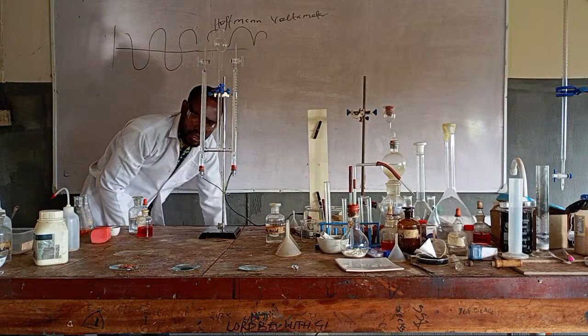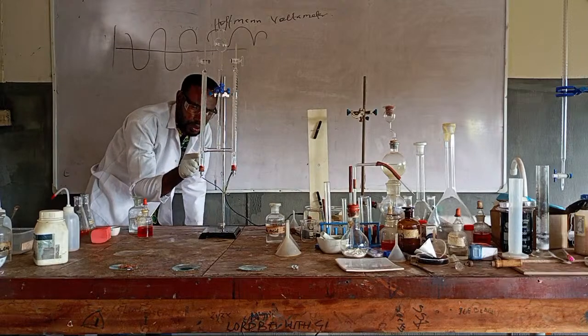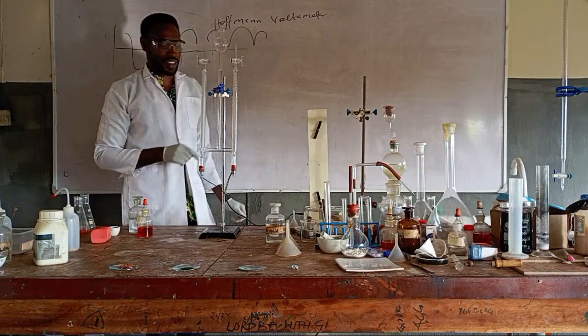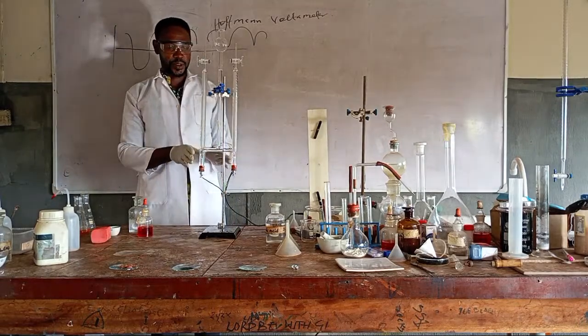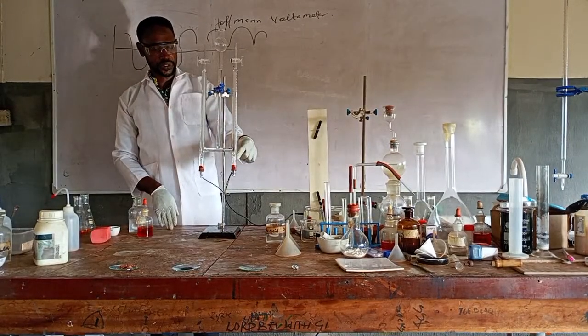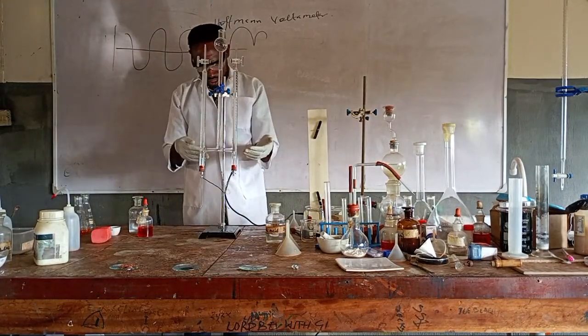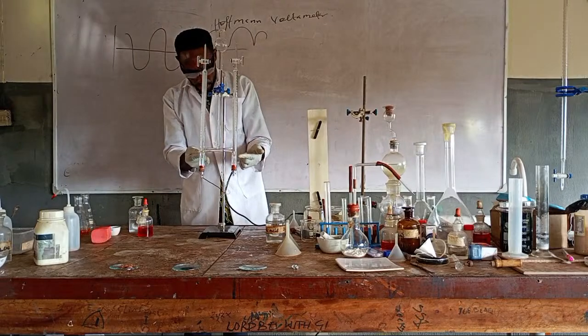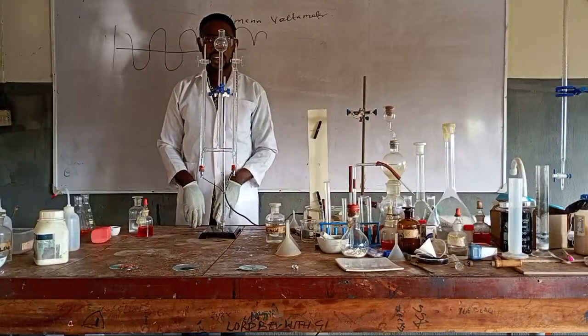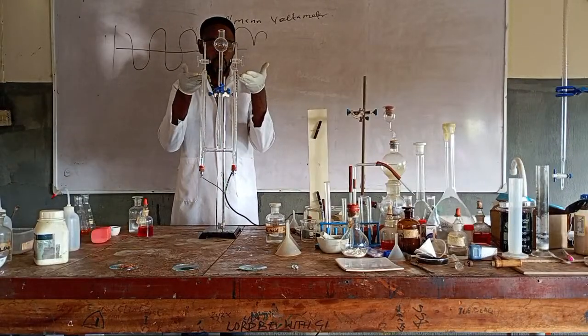If you watch closely, you can see bubbles. Are you seeing something? Okay, don't worry. But just know that the electrolysis is in progress already. For some of you, you can gradually come close and look. There are bubbles. You start seeing that the water will now keep going down. Are you seeing it now? Yes.